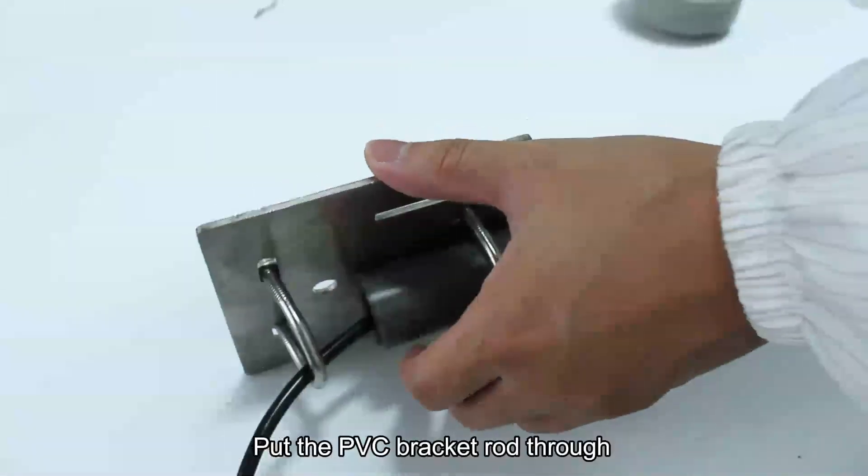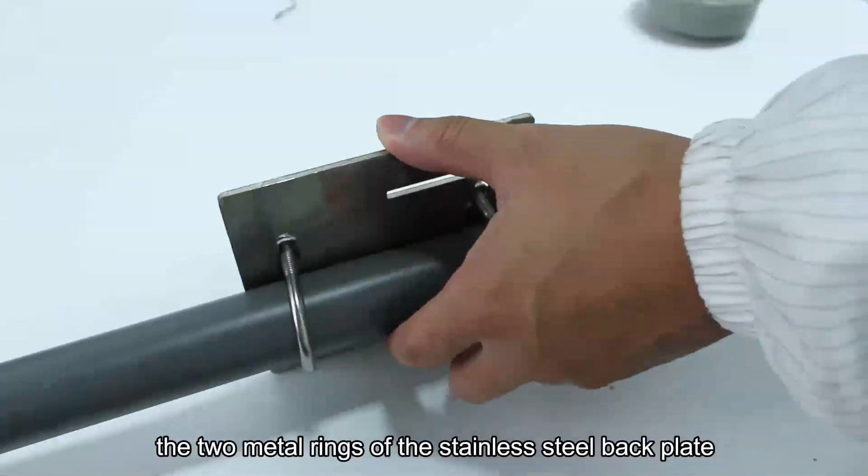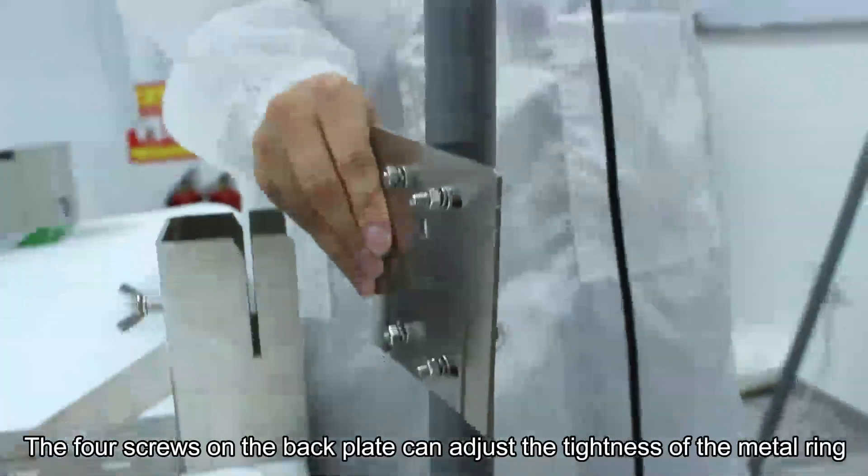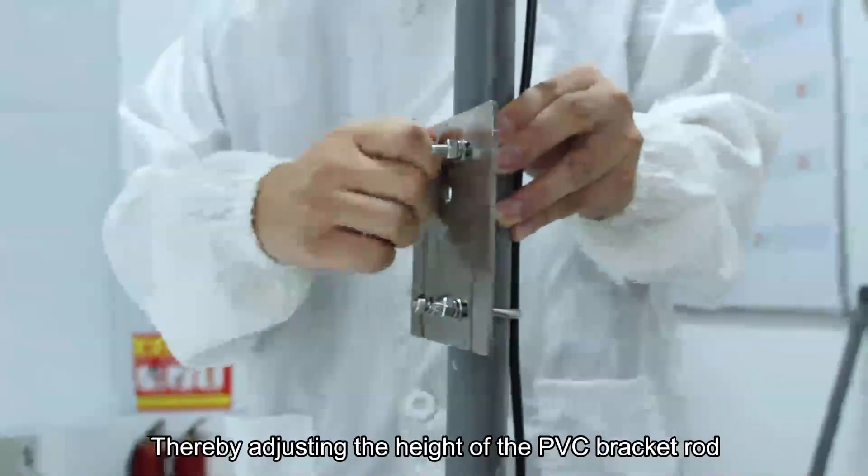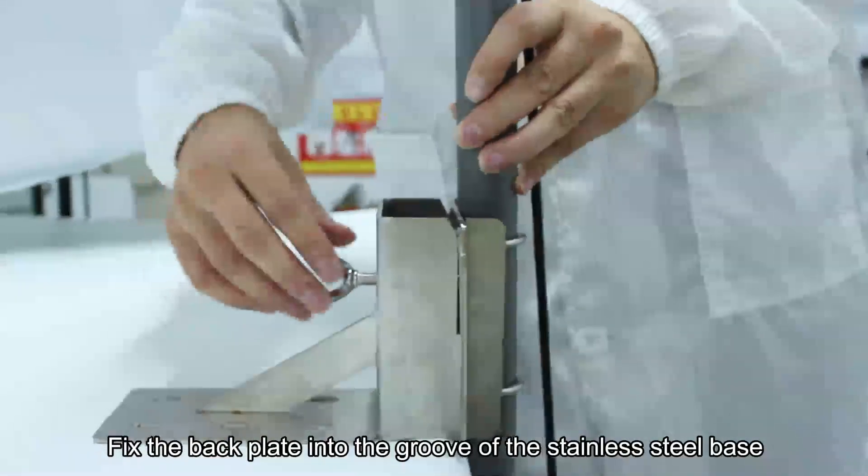Put the PVC bracket rod through the two metal rings of the stainless steel backplate. The four screws on the backplate can adjust the tightness of the metal ring, thereby adjusting the height of the PVC bracket rod. Fix the backplate into the groove of the stainless steel base.